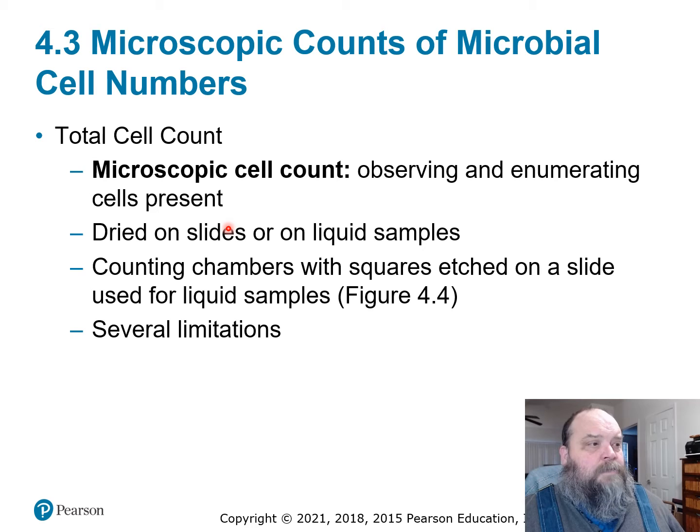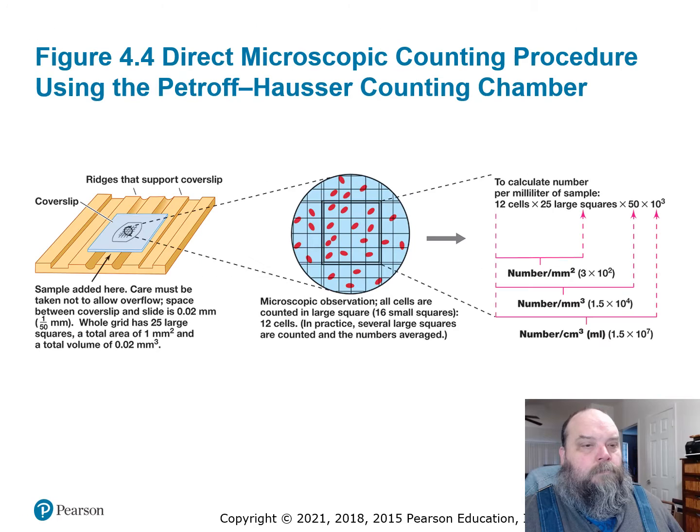Okay, you've got something that's so small you have to have a microscope to see it. That's not a problem there. They're so small and they have no pigment, so light's going to pass through them. Well, that causes a problem. So you're going to have to dry them on a slide, and then somehow add a bit of stain to them, and in the process, not rinse any of it away. Well, shit. Now it's getting hard again.